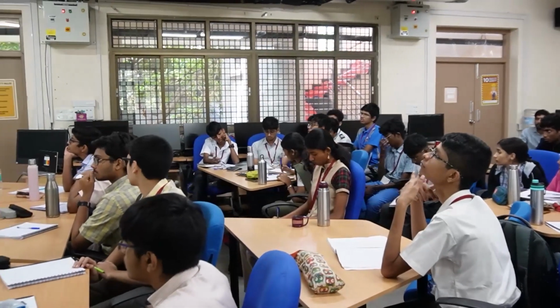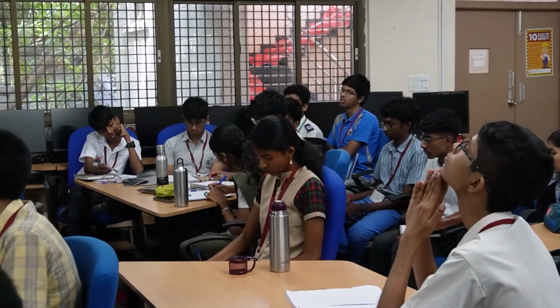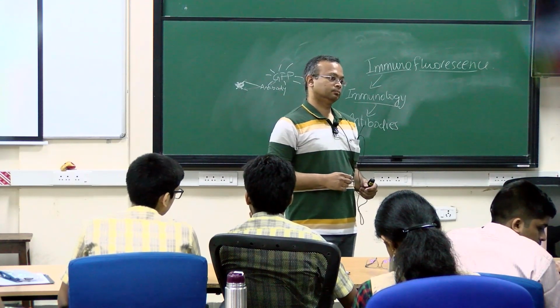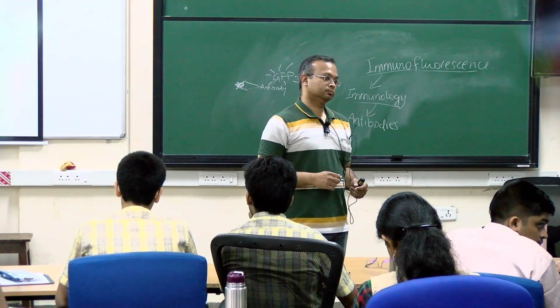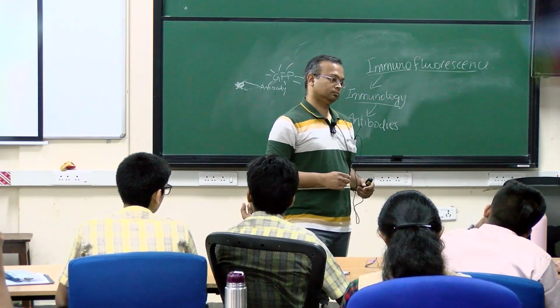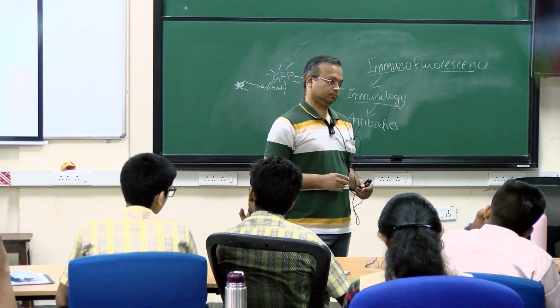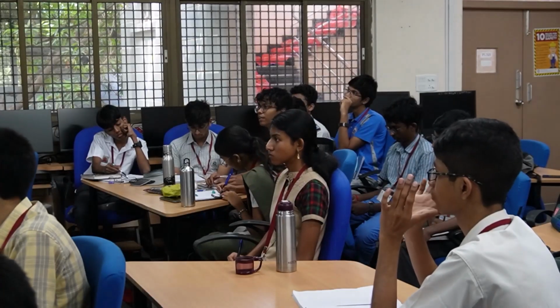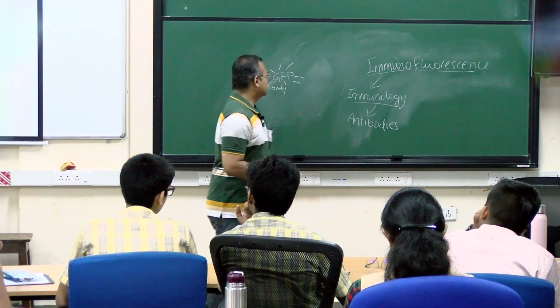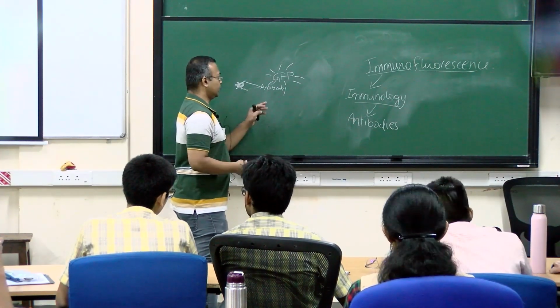How does this help us overcome the resolution limitations of a normal microscope? Because we learned about Abbe's criterion, and usually when we talk about these things, we say that they're smaller than the wavelength of light, right? Even though fluorescence microscopy will tell us that it is there, it doesn't tell us how many, or anything about the dimensions or the shape of that. So how do you overcome this? I'll come to that. In the later slides, I'll come to how we get over that resolution.